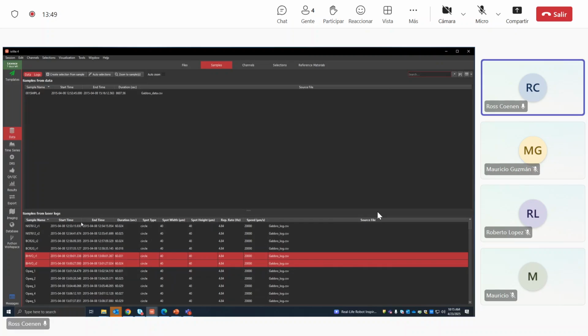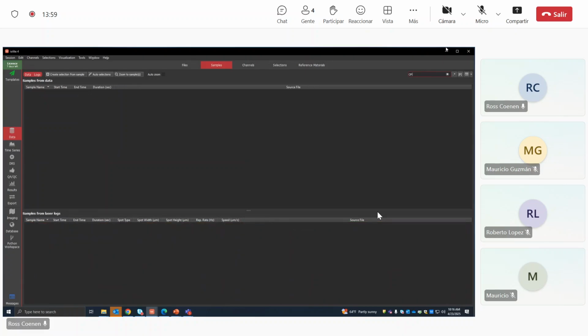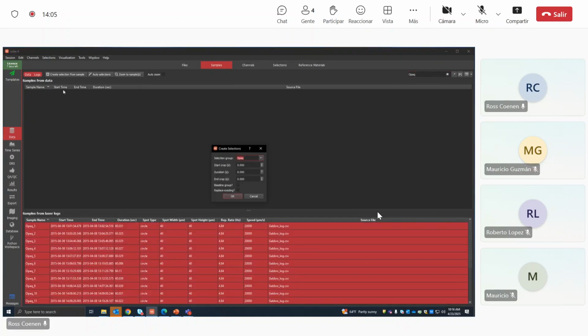So after that, we're going to select our unknowns. So this OPAC is our unknown. And so it doesn't recognize that as a standard, so we're going to call it whatever we want. So OPAC unknown. Okay.